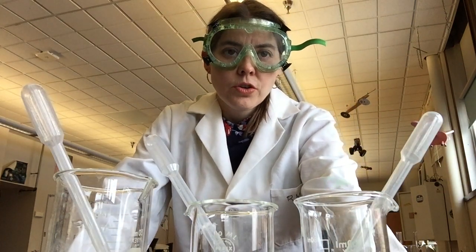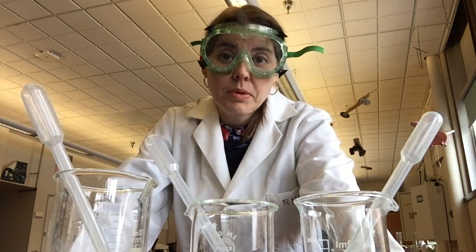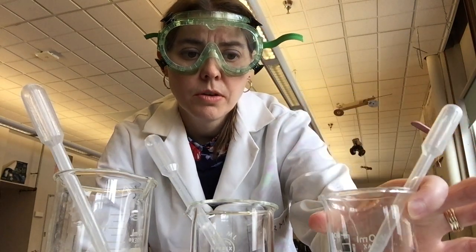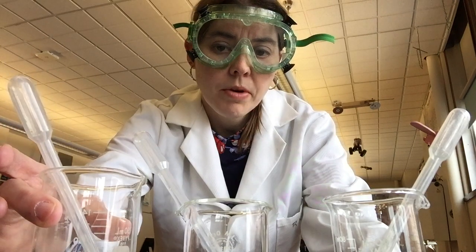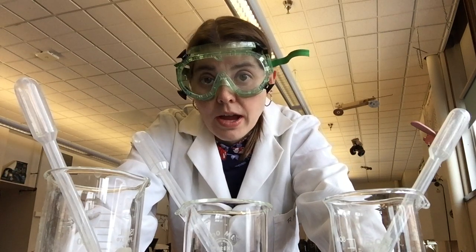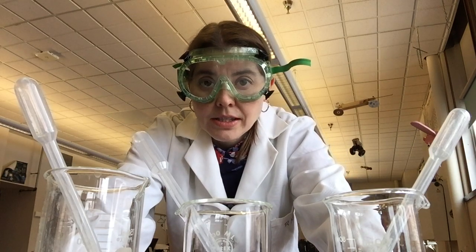I want to show you another demonstration. When it comes to figuring out if something is an acid or base, you can use something called litmus paper — litmus paper will turn different colors in the presence of an acid or base. I have three beakers here, and all of them are clear liquid. One is an acid, one is a base, and one is just water. I'm going to assume they're all dangerous and won't know which is which until I test them.